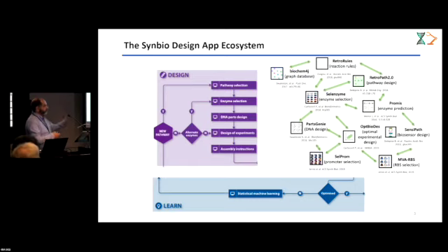These were all individual tools, but they can exchange data. That took several years, but in some way that was the easy part of automating the DBTL cycle, because we were just working with software.